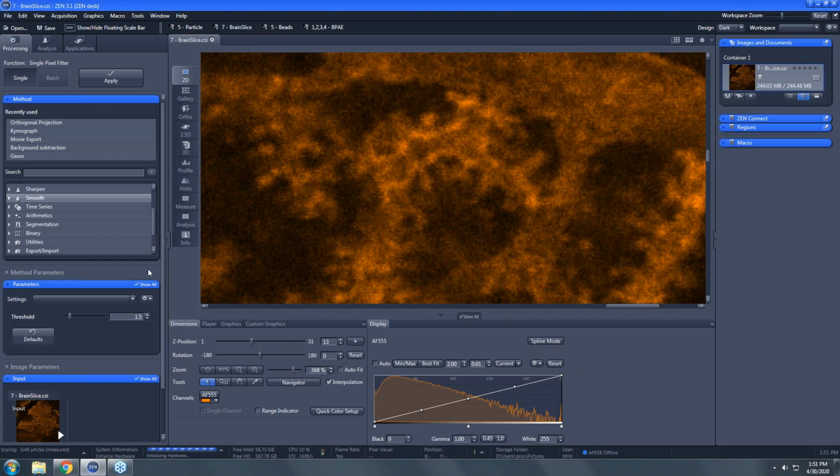There are the equations for what was done in the help file generally. In this case, single pixel filter, we're filtering out pixels that are dramatically different from their neighbors. Their value gets reset to the median value of the neighboring pixels.